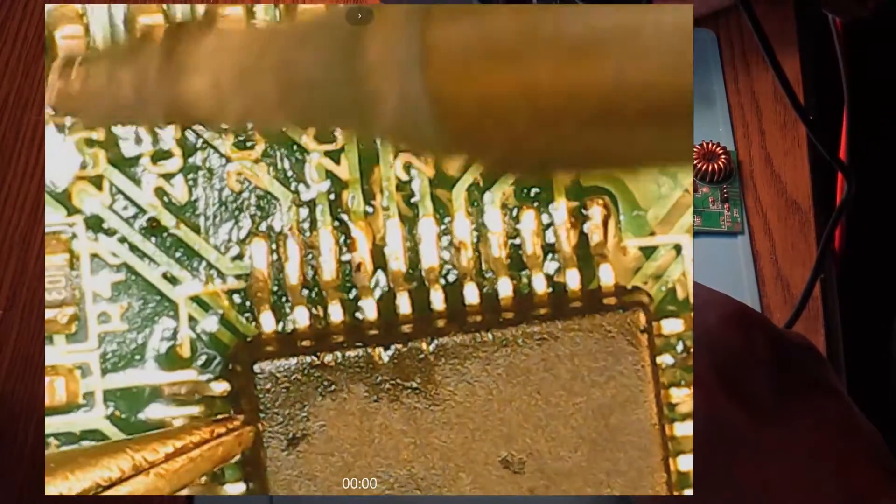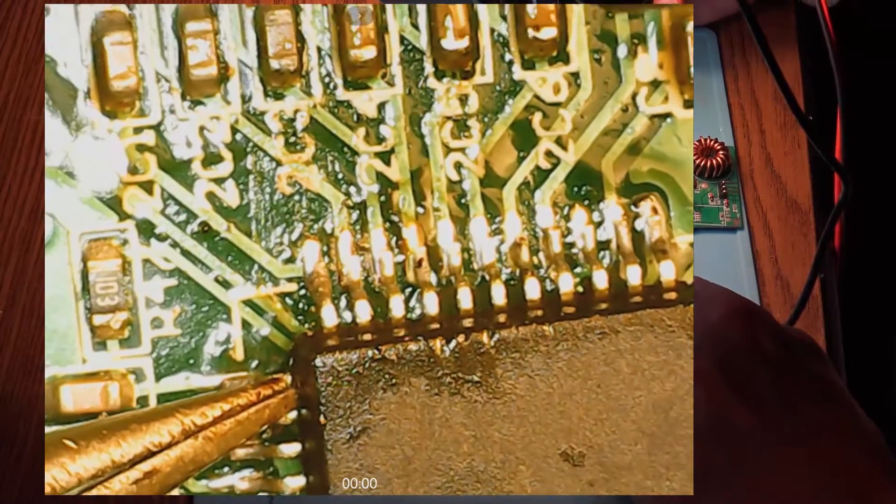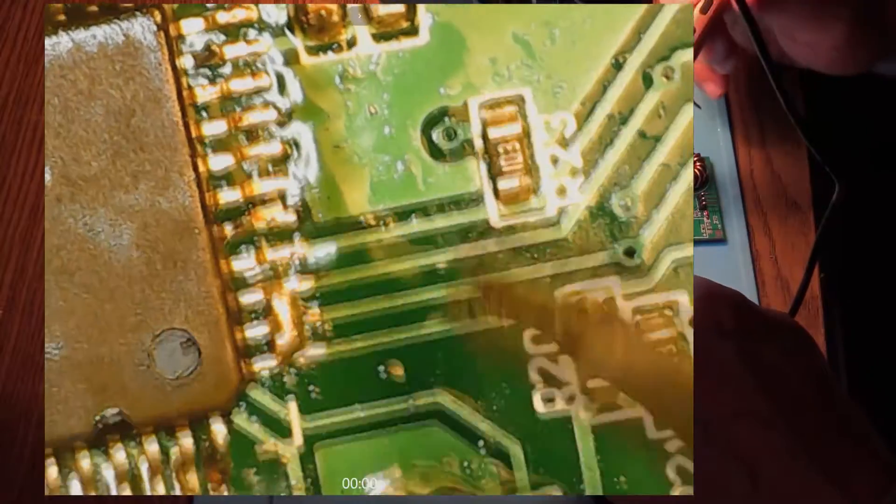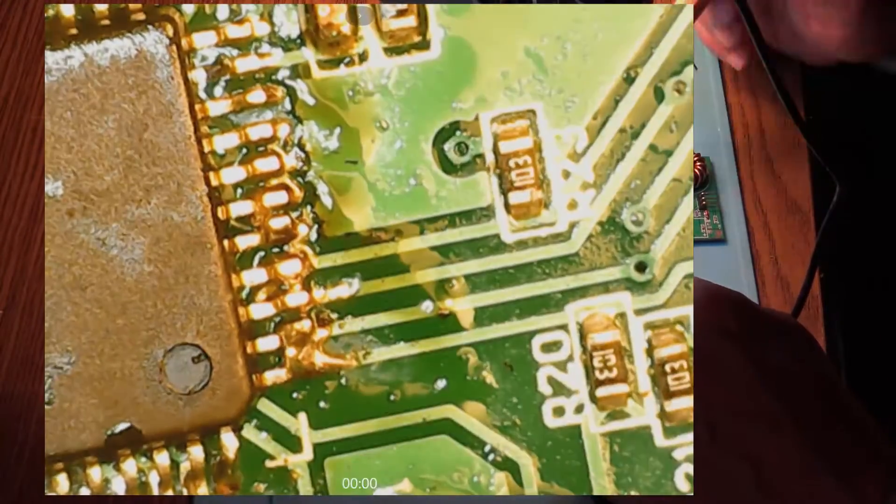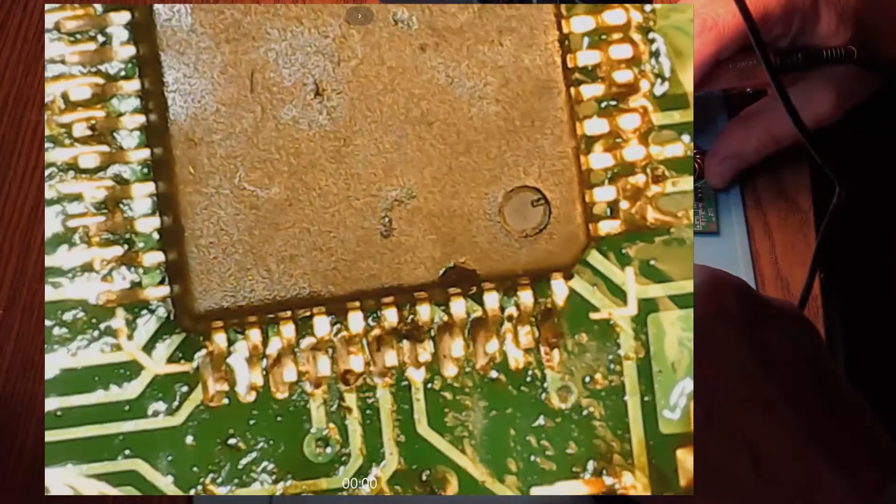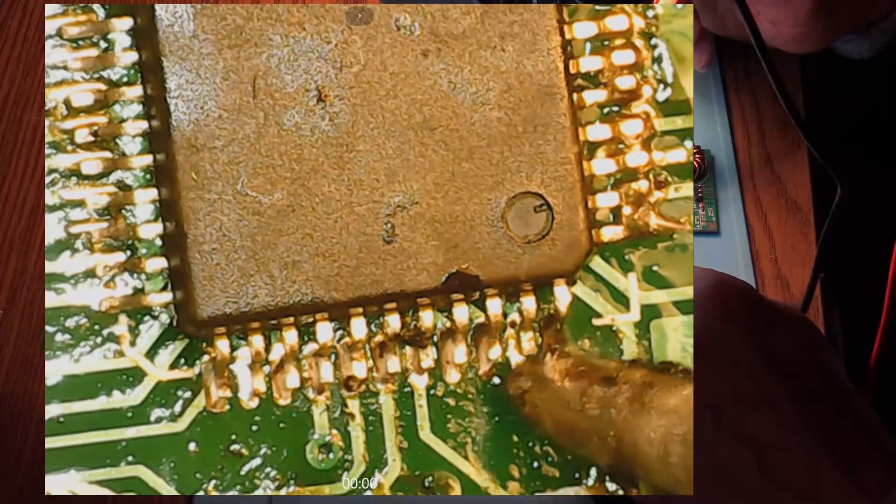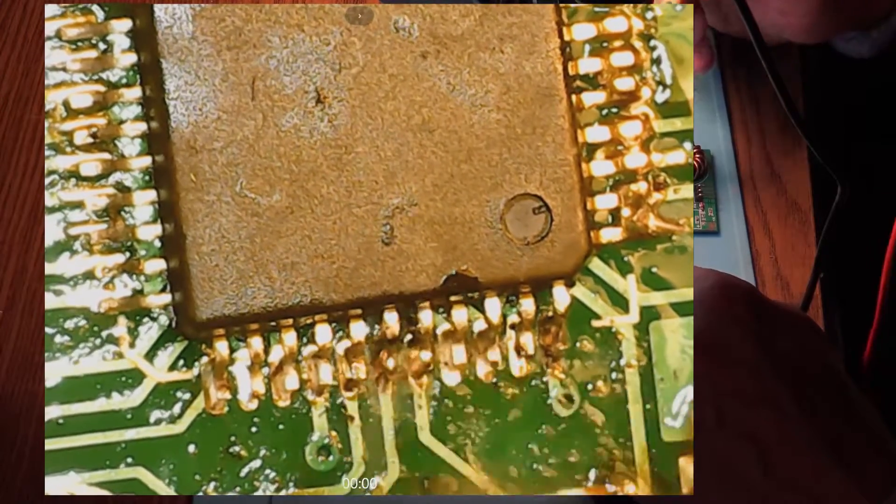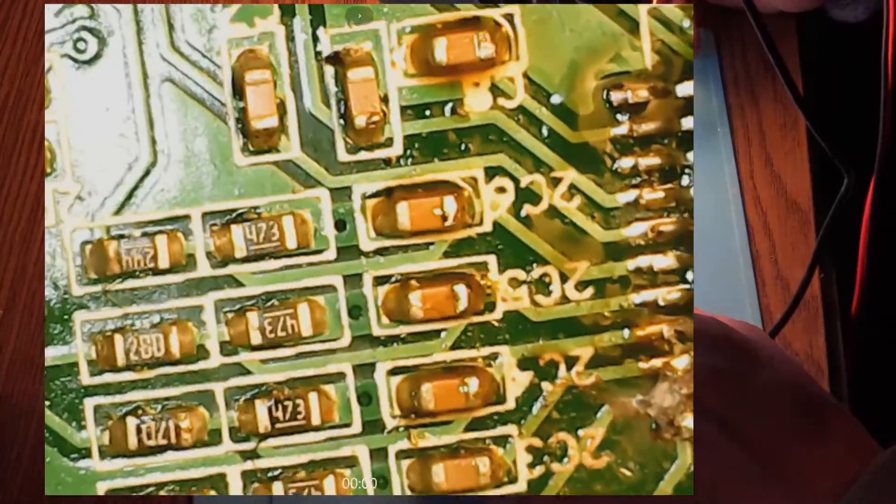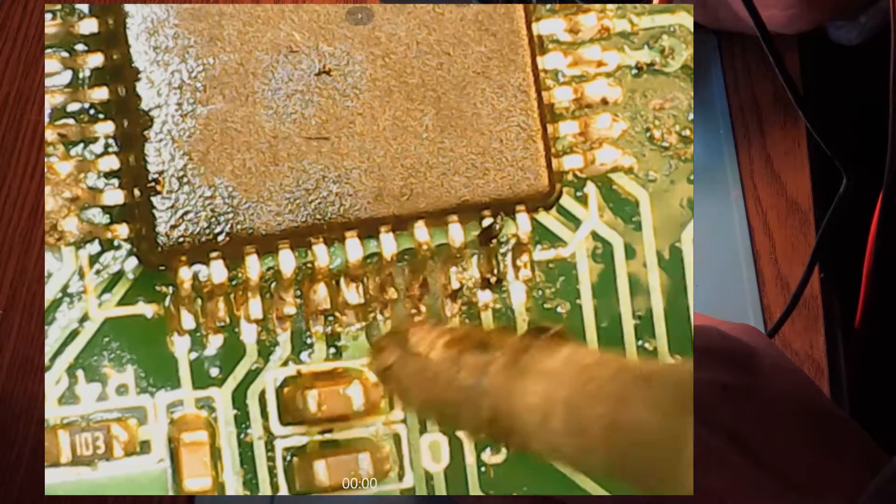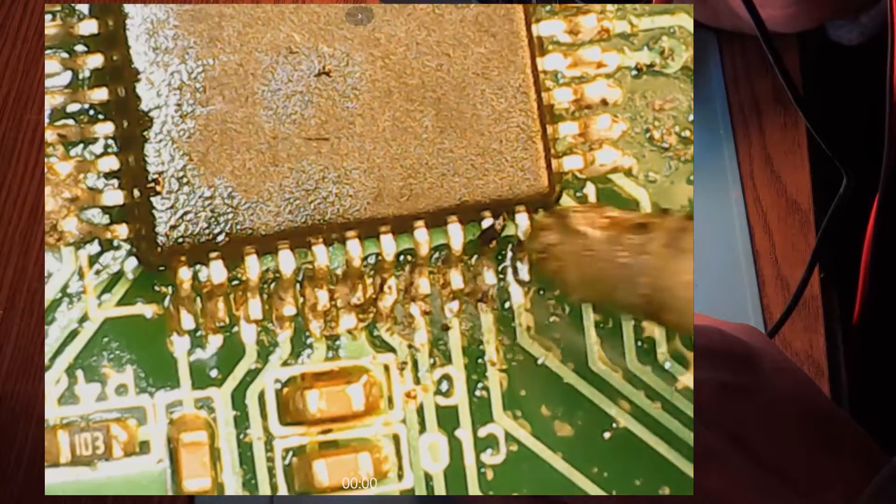I need another one. Here, what do you think? That's okay, I'll fix that later. What about here? Good. Not so good down here but anyway, of course it can be better. But it's just the idea - can we use this little microscope or not? Well, I think all I can feel is a little delay, but it's not so tragic.